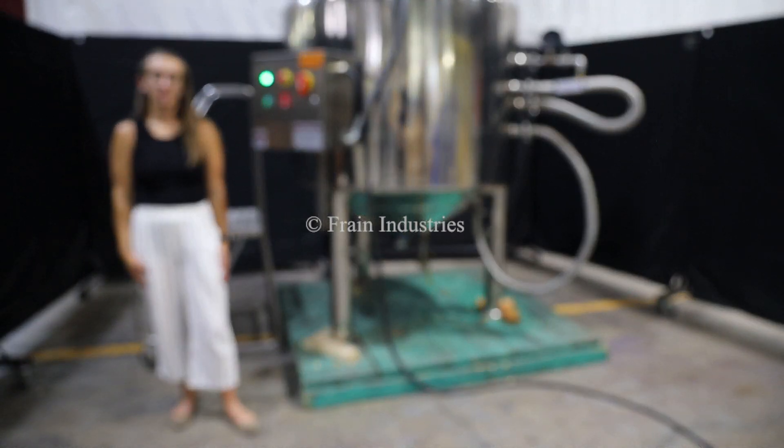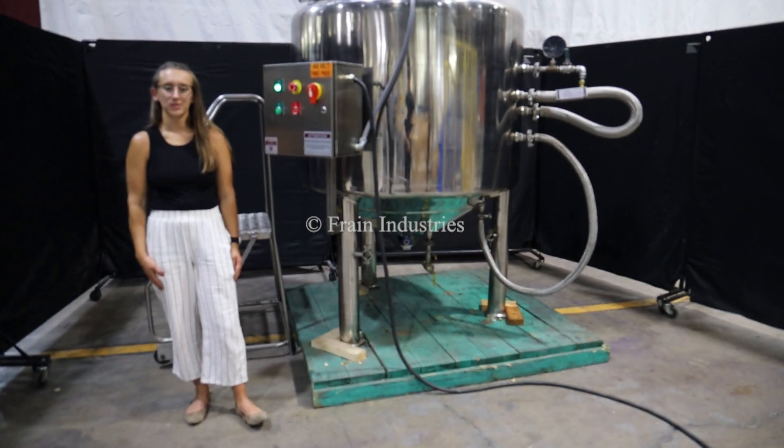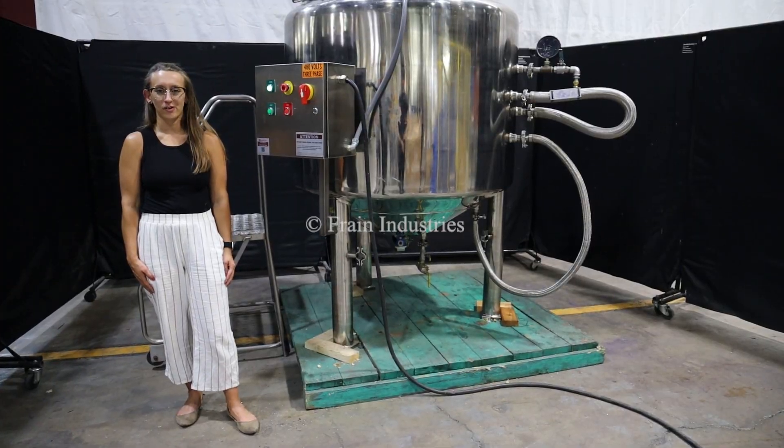Hi, I'm Alina with the Frain Group. Today I'll be cycling your Burley Falco 200 gallon stainless steel jacketed mixing vessel. This machine is currently set to 3 phase, 480 volts. We recommend reading the manual in its entirety before powering on the machine.